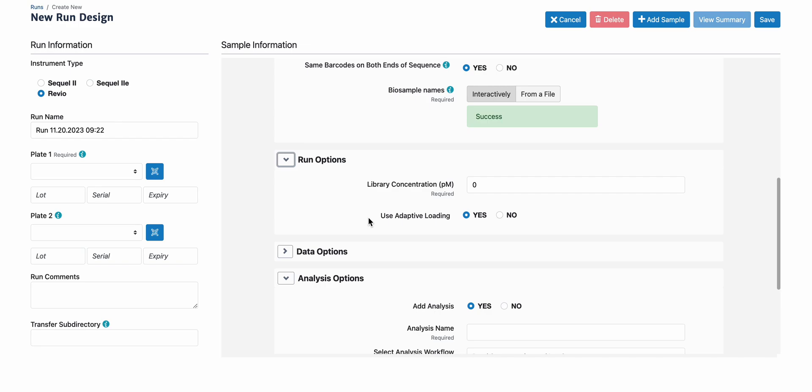All Kinnex libraries should be sequenced using adaptive loading on Sequel II, IIe, and Revio systems.